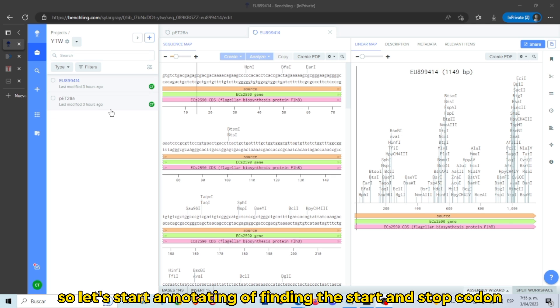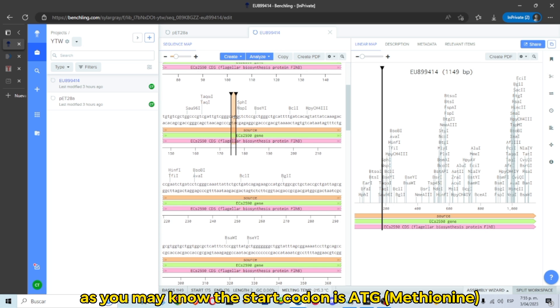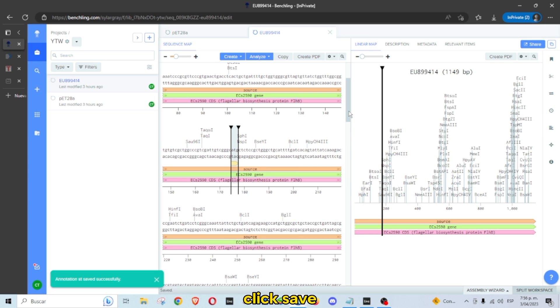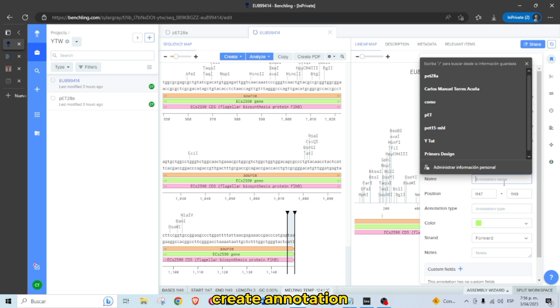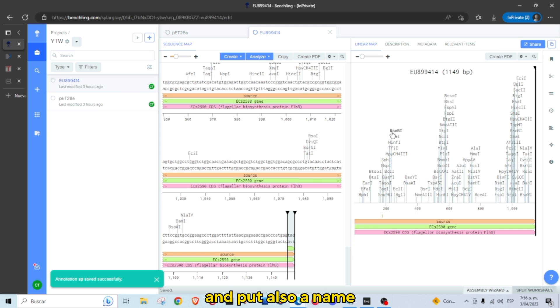Let's start annotating — finding the start and stop codon. As you may know, the start codon is ATG. Here we have it. Click Create New, put a name — I'm going to put 'start' — and click Save. For our stop codon, TAA, which is one of the three stop codons, create an annotation and put the name 'stop'.